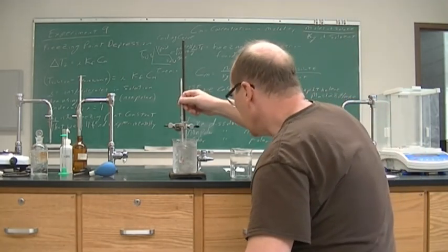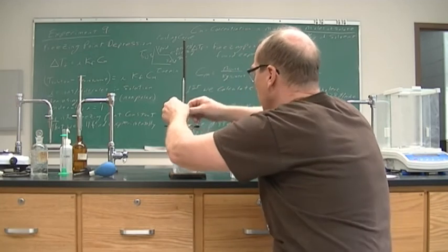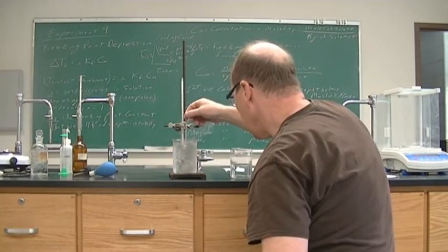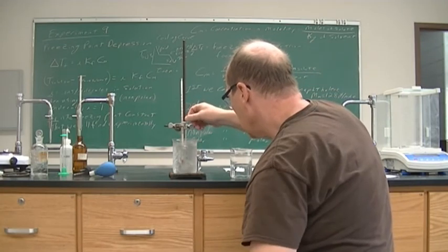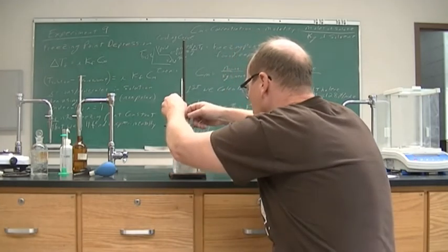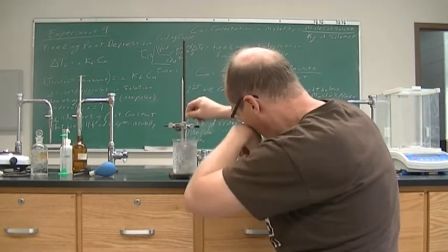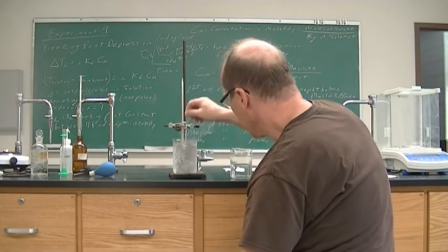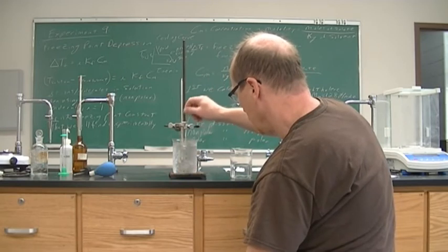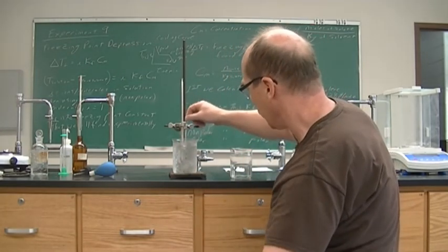All right, so we are at 9 degrees Celsius right now. So it went down very fast. All right, 15 seconds later, we're down at 8. When the cyclohexane froze, the whole thing turned a cloudy color, and it was easy to see.